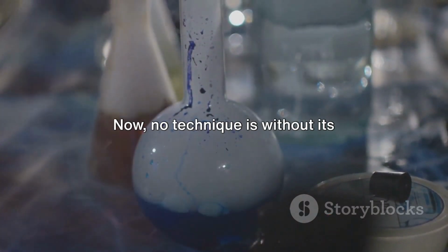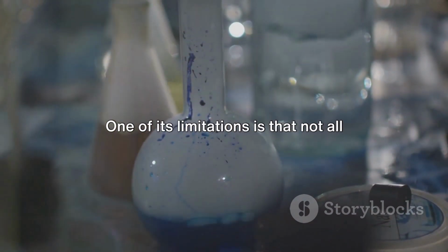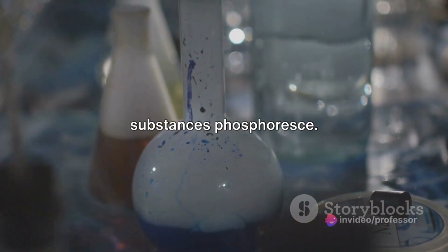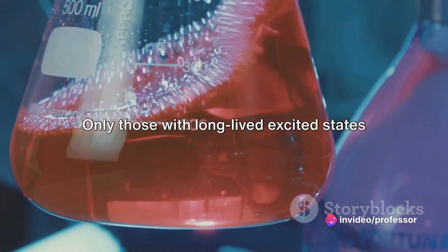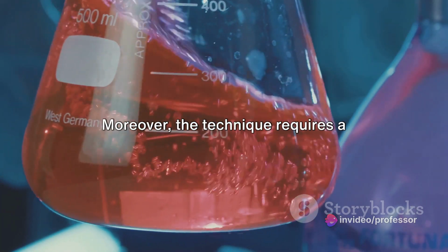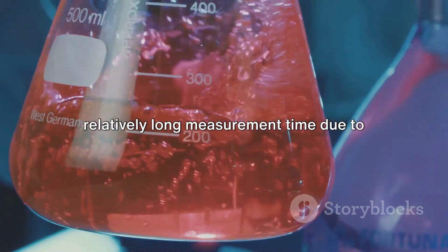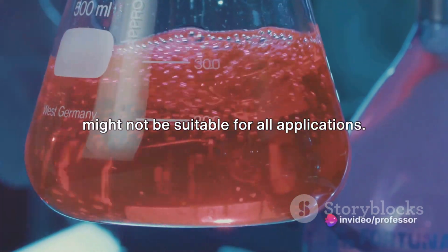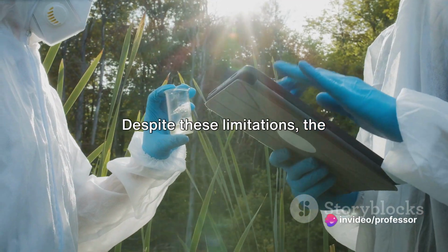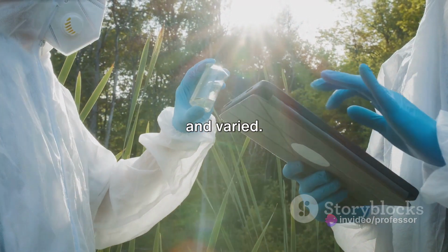Now, no technique is without its drawbacks, and phosphorimetry is no exception. One of its limitations is that not all substances phosphoresce. Only those with long-lived excited states can be analyzed using this method. Moreover, the technique requires a relatively long measurement time due to the slow decay of phosphorescence, which might not be suitable for all applications. Despite these limitations, the applications of phosphorimetry are vast and varied.